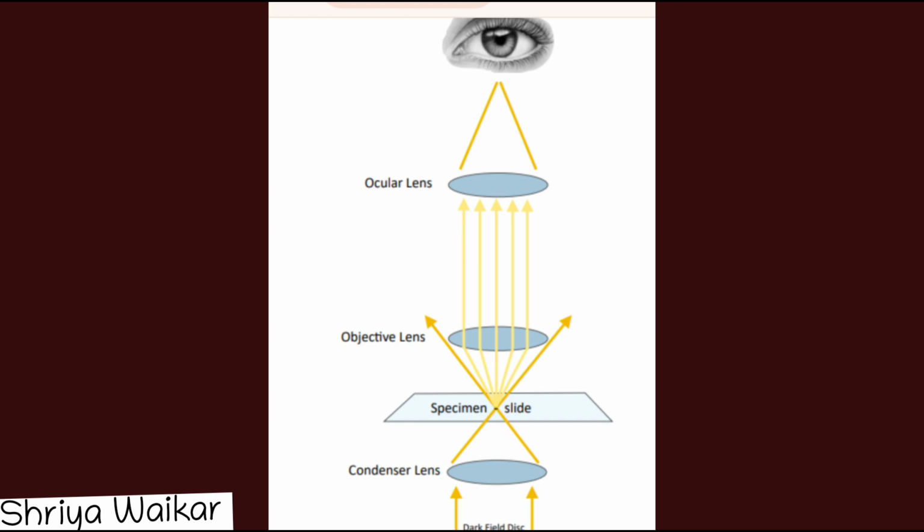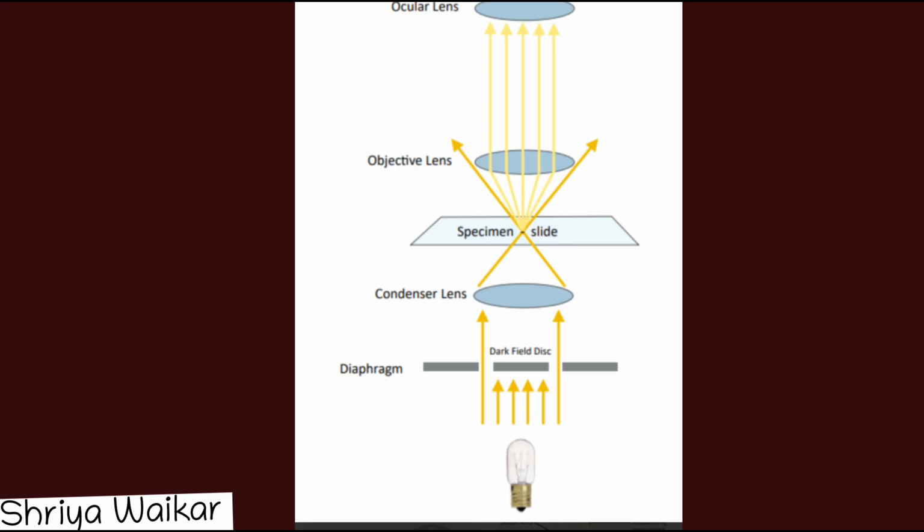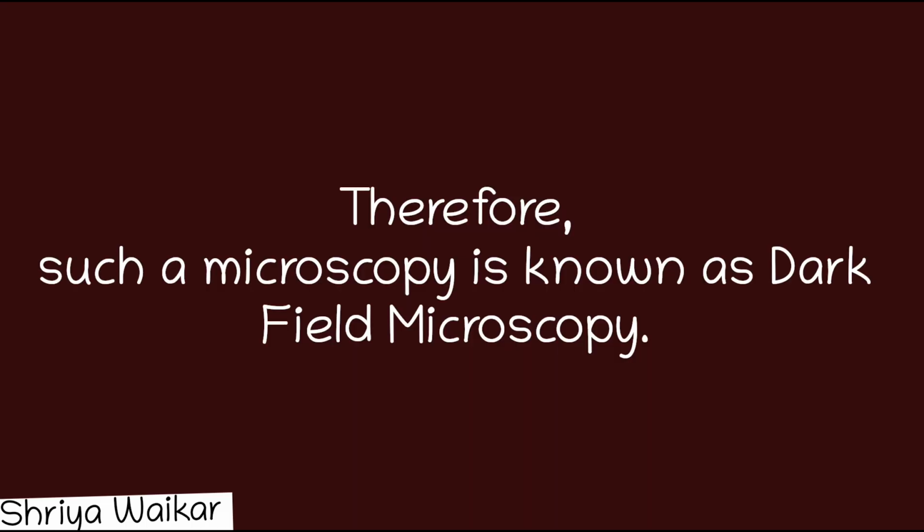Then a different form of microscope. To study the minute details of internal organization of the tissue cell, which is so diverse, cannot be achieved by the light microscope only. Therefore, other, quite diverse forms of microscope are used. In one such, light falling on the object from the central condenser is blocked by a stop, and illumination of the object is done by an oblique light beam that is reflected from the slide, and the image is illuminated against a dark background. Such a microscope is known as the dark field microscope.